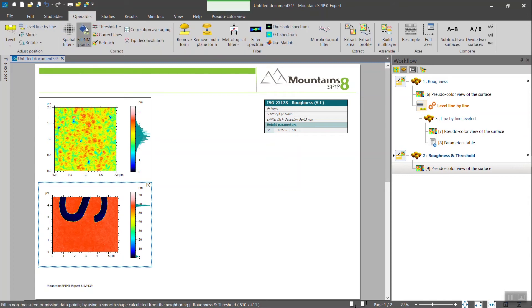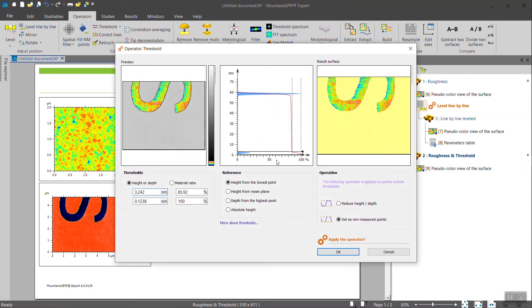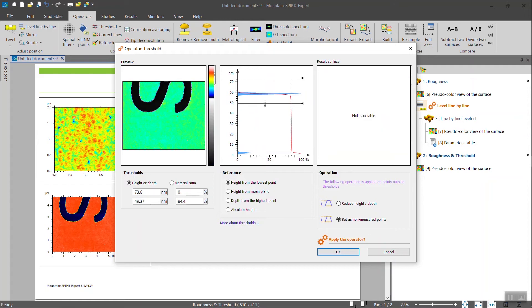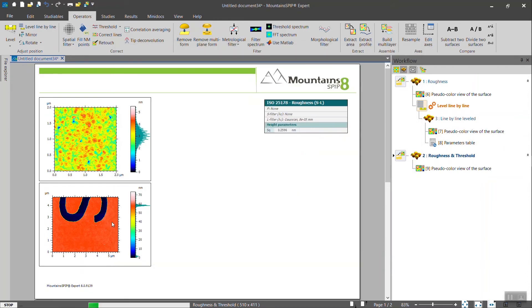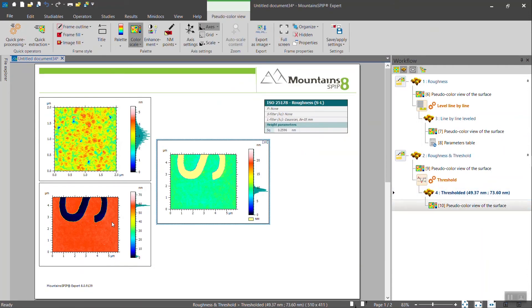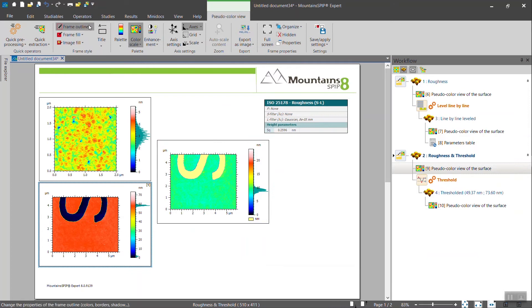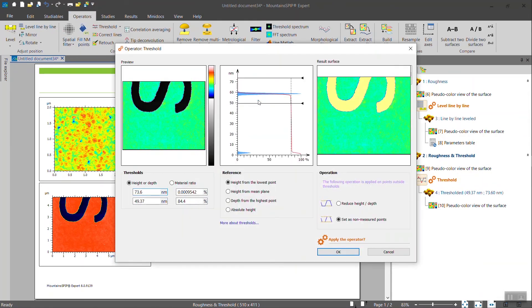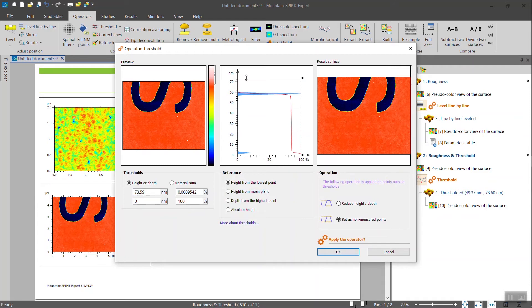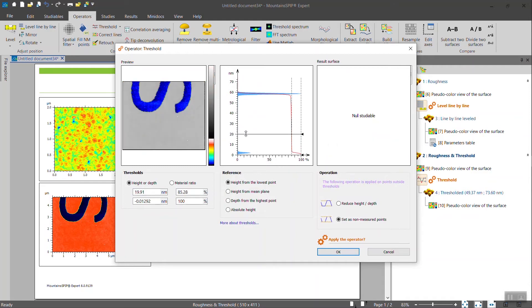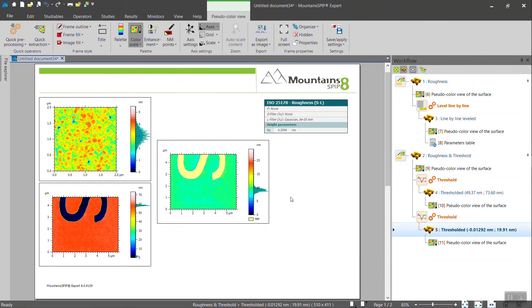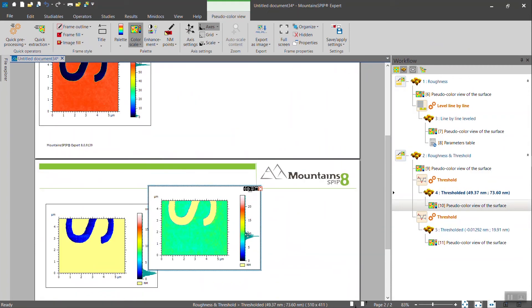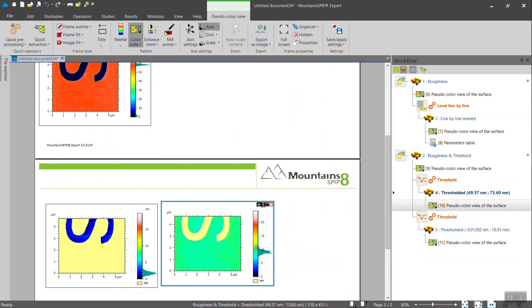First, we use the threshold operator. We isolate the top layer like that. We do it another time. We isolate the bottom layer like that.